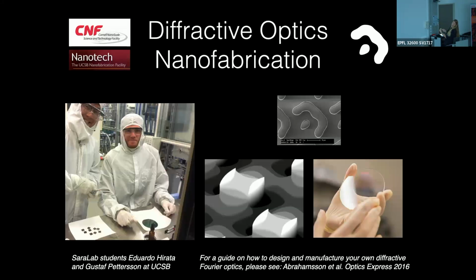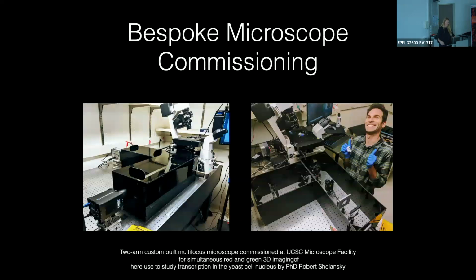Now I wanted to make this grid, but I could also have made an image of a dinosaur or whatever I wanted, right? So this is just to illustrate that I'm getting all of the light through here, and I can choose the distribution. So here's the amplitude grating with chrome and the phase. Don't cut yourself on these because they might have sharp edges. So that's what diffractive optics looks like.